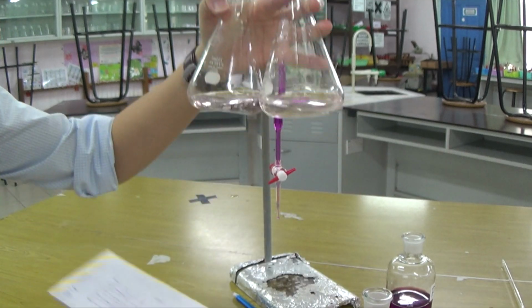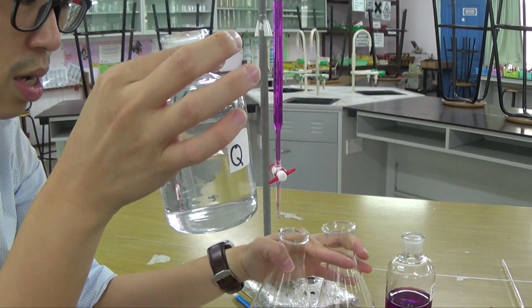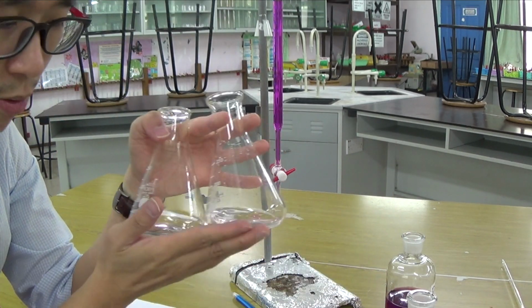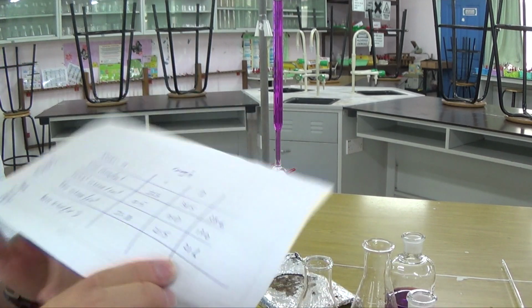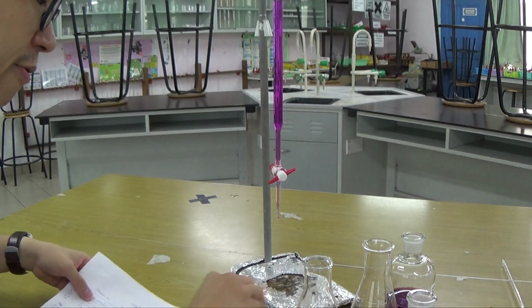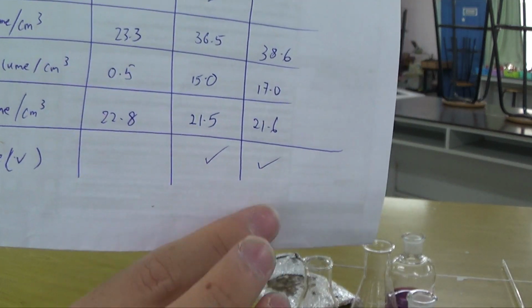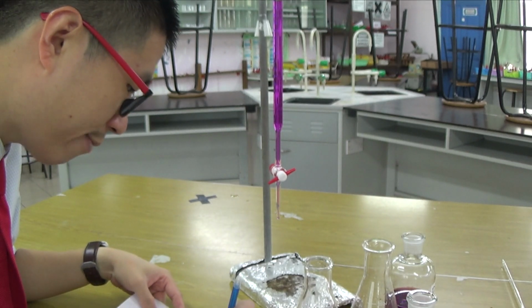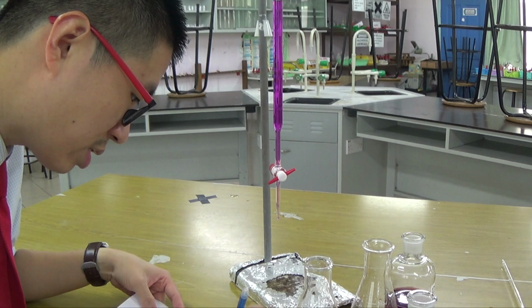But based on what I have seen, I could see the color change because I have my nearly colorless solution to begin with, and when it gives me a permanent pale pink, that is where I stop. So I think my 21.5, my 21.6 is perfectly acceptable as my best titer, which I'm going to put a tick on. When I do my averaging, I have to show my working: average 21.5 plus 21.6.